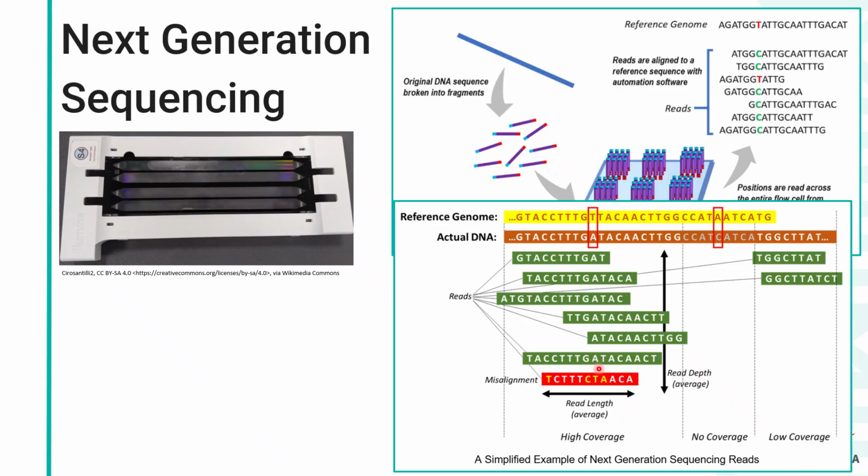Well, see, the fact that you have so many other A's, this means that this is most likely a misalignment, meaning that that probe didn't actually connect in the right place of DNA. And that can happen sometimes. There are some portions of DNA that are called highly repetitive areas. They're where the DNA repeats itself in the same sequence over and over and over. And if you're repeating that same sequence, it's hard to be able to design a probe that is going to recognize that it's attached to one part of that repeating pattern and not another part. And that results in a misalignment.